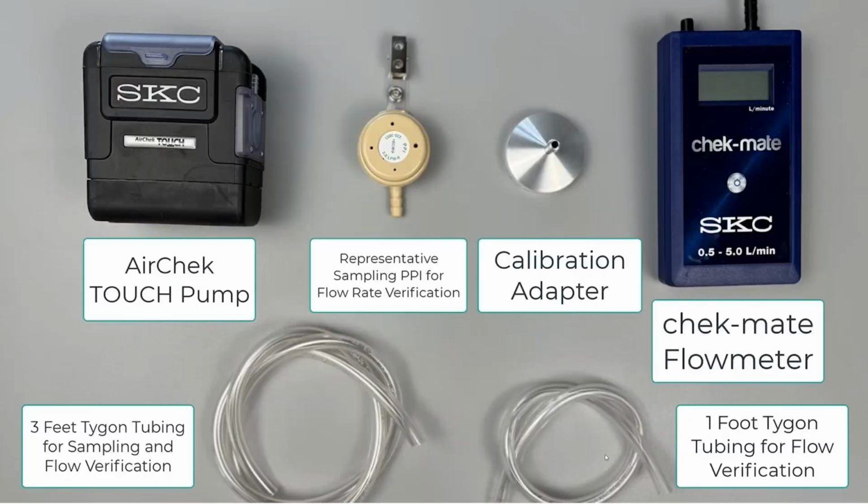So this is a screenshot of a YouTube video that I did last year on how to properly check the flow and adjust the flow of a pump when using a PPI. This is just in general what you need. You need a pump. In this case, it's the AirCheck Touch. You have a representative PPI for the actual flow rate verification.